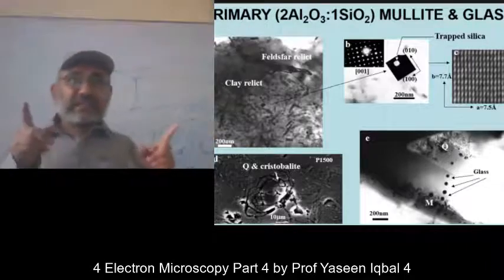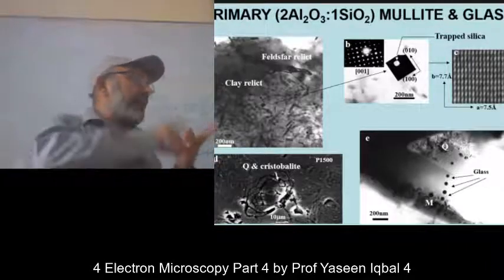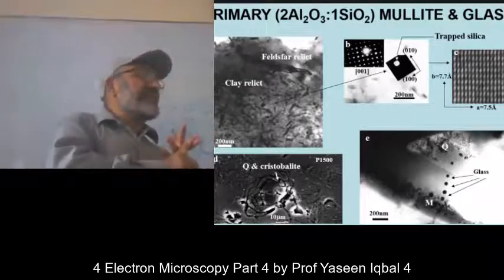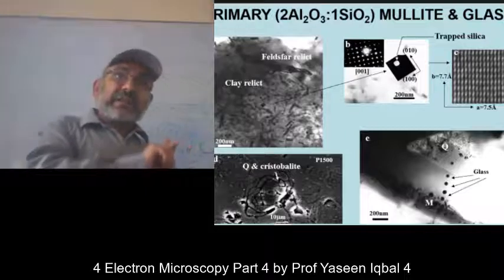So, transmission electron microscopy, chemistry, morphology, and crystal symmetry. All the three things are there.